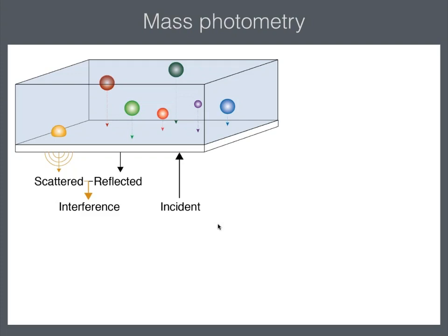Ultimately, the methodology works by having a droplet of solution, a small quantity of solution, on top of a glass slide. And so that's represented here. In that droplet of solution, we have our analytes of interest, right? I've just color-coded them here in 7 different colors for the 7 different molecules. Broadly speaking, 5 seem around the same size, and a couple seem smaller. They're in solution at varying distances away from the glass slide, the surface that we're actually going to use essentially as our detector.